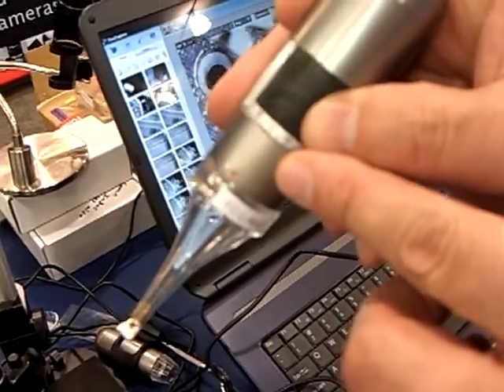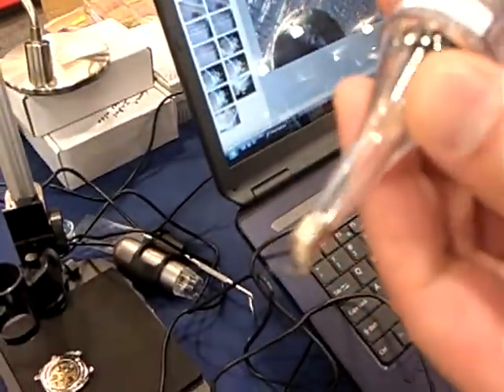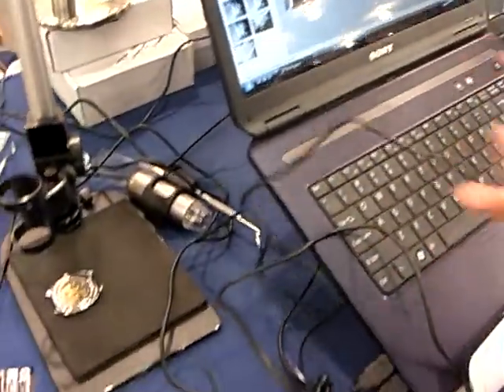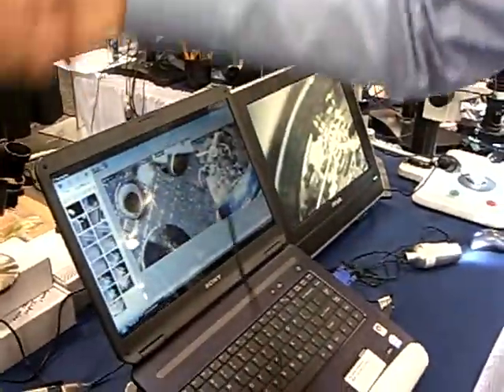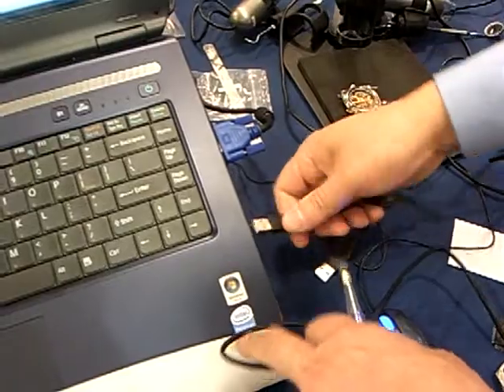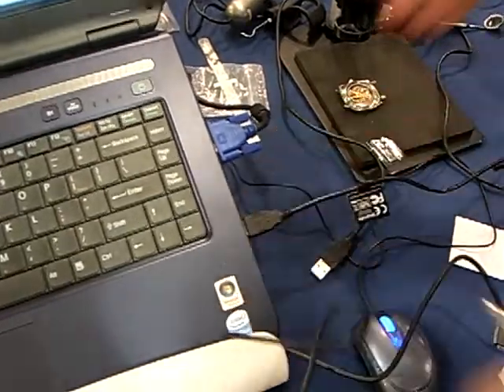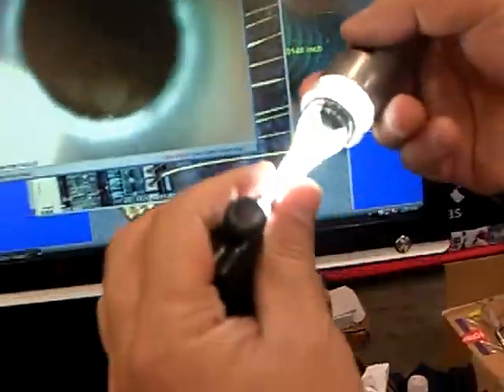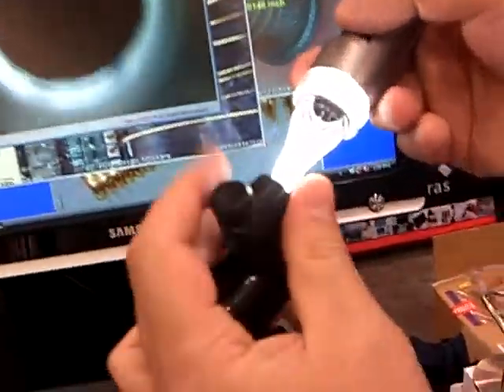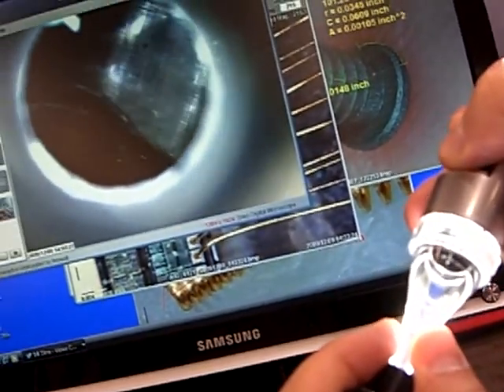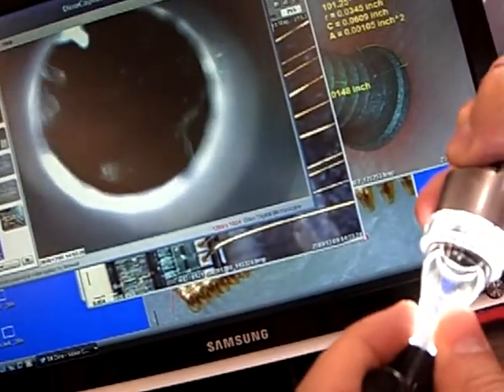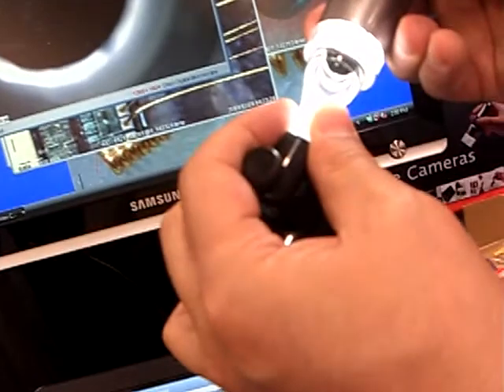Let me demonstrate something here. You need to unpack and set it up. I pull it out and put it in. Once I put it in, I find the object like this one. I want to see inside the object, so I go inside the hole and focus. You can see inside there's something scratched.